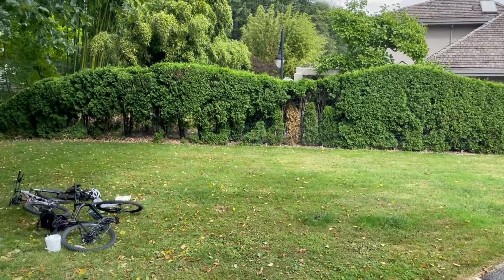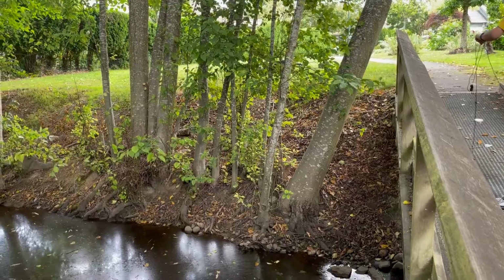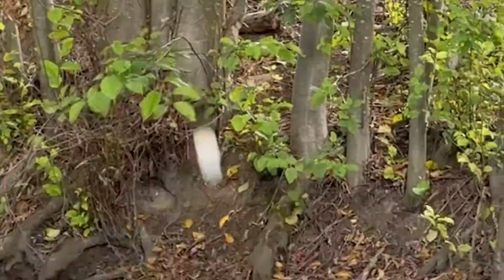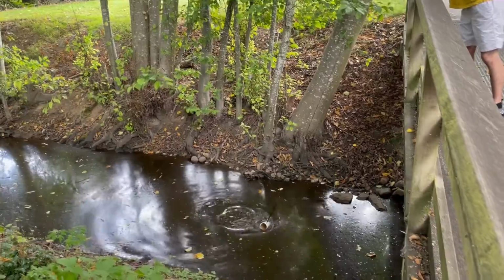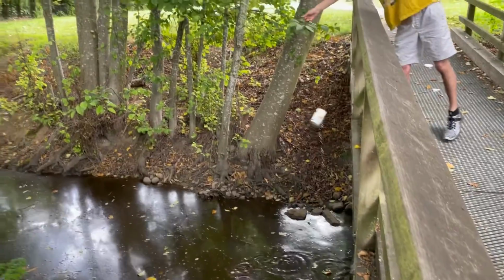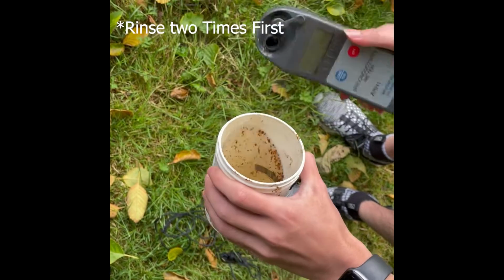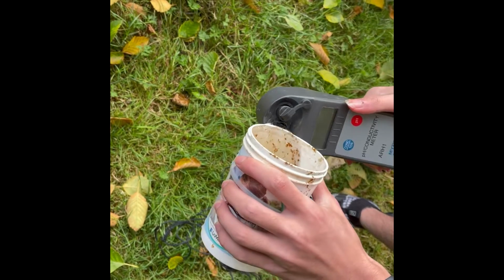Find a safe location to perform your experiments similar to the area as shown in the video. Pour the water collected from the creek into the electrical conductivity meter collection slot and record the value shown on the digital display.